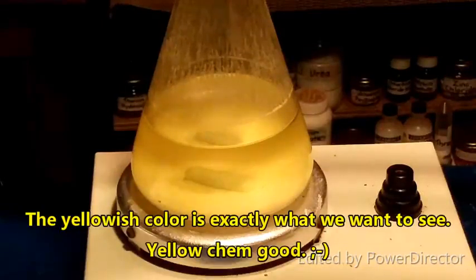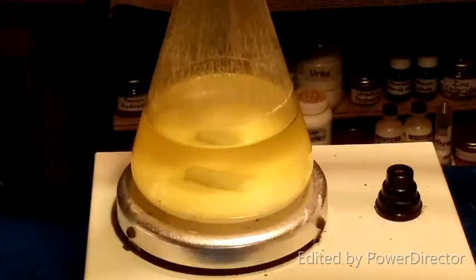And it looks like it's very tame. So the next step is to filter off all of the precipitate here. Rinse that with some acetone, combine that with our filtrate, and then we are going to distill off the acetone. That will give us our crude diiodomethane, and from there it is just a question of working it up.